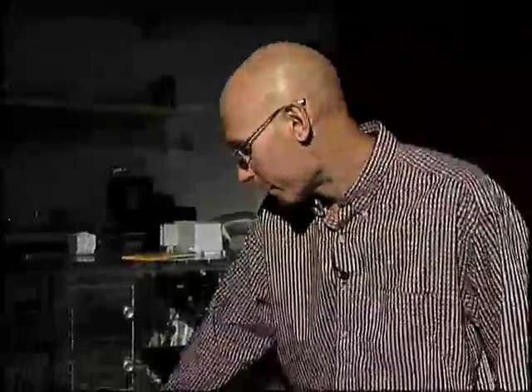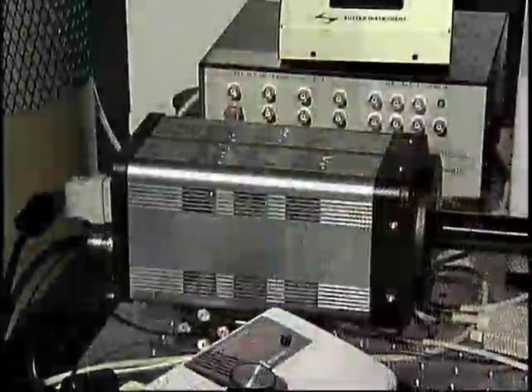You'll notice that the confocal head sits between the microscope and the camera, which is this unit out here. So this is effectively a passive unit. It provides illumination, but the confocal part is done entirely without any control. The disk just spins and you get a confocal image. So you can put this between any scope and any camera and get a confocal image. The lasers that supply the illumination sit off to the left of the scope over here.